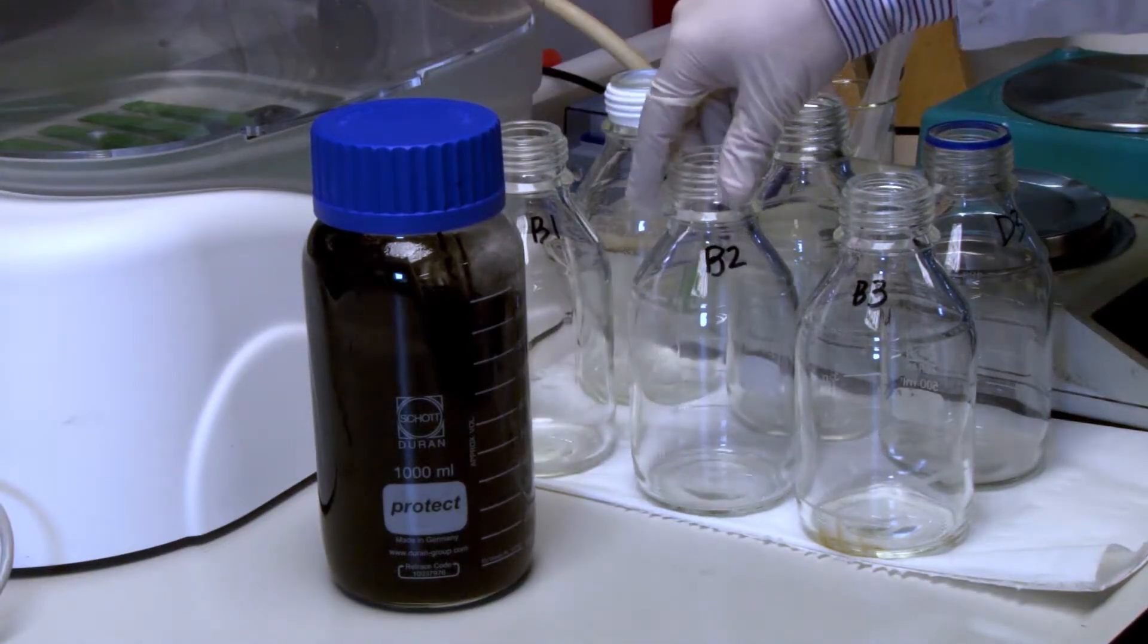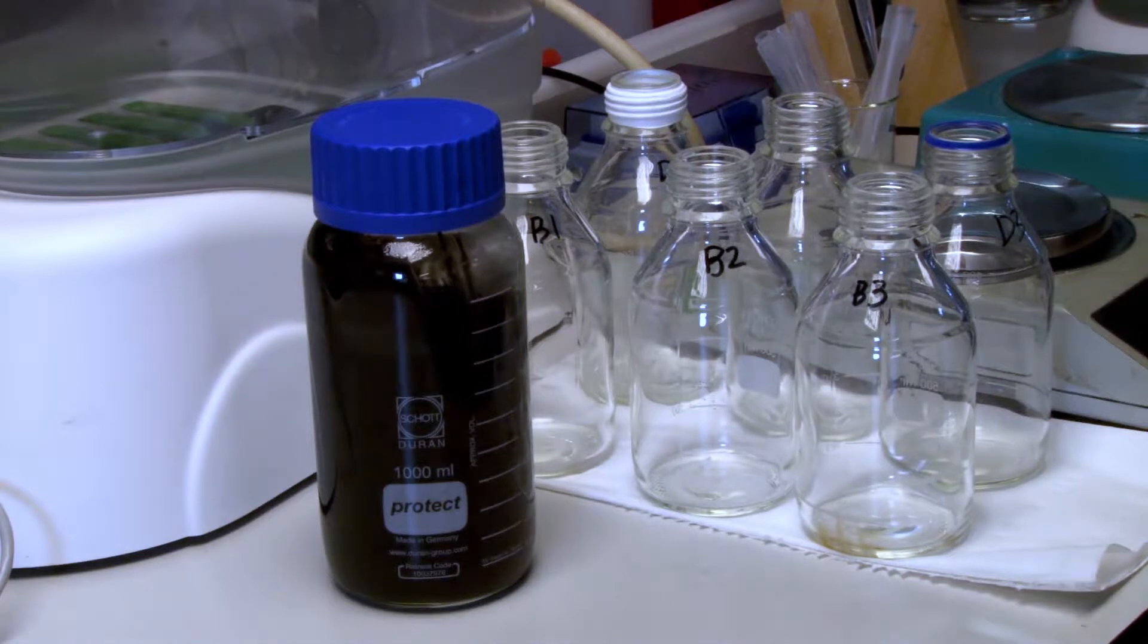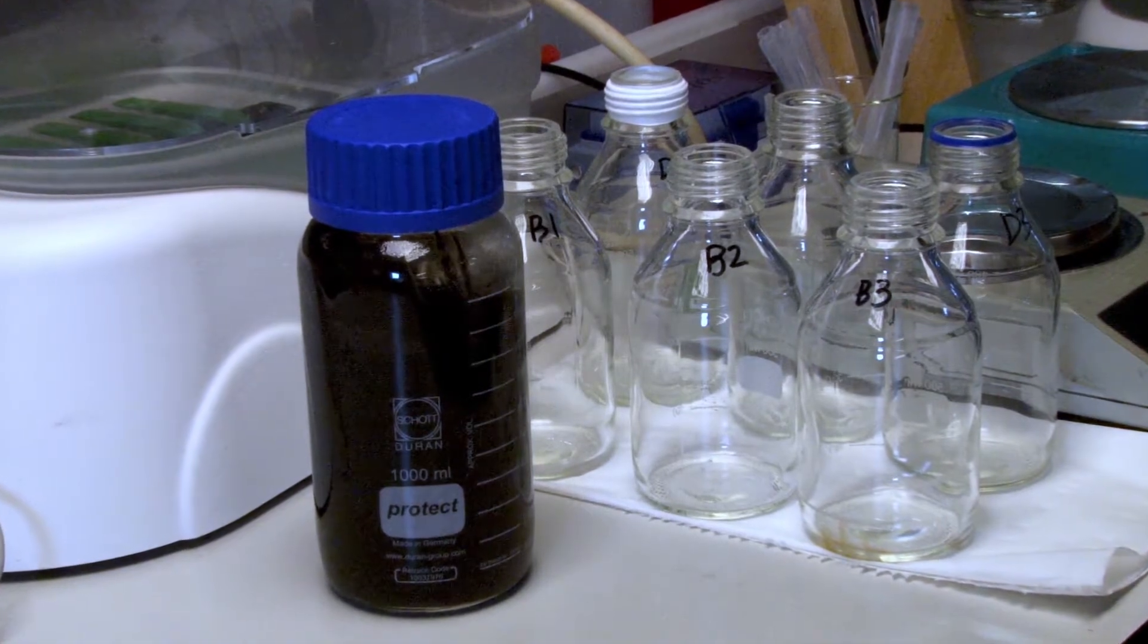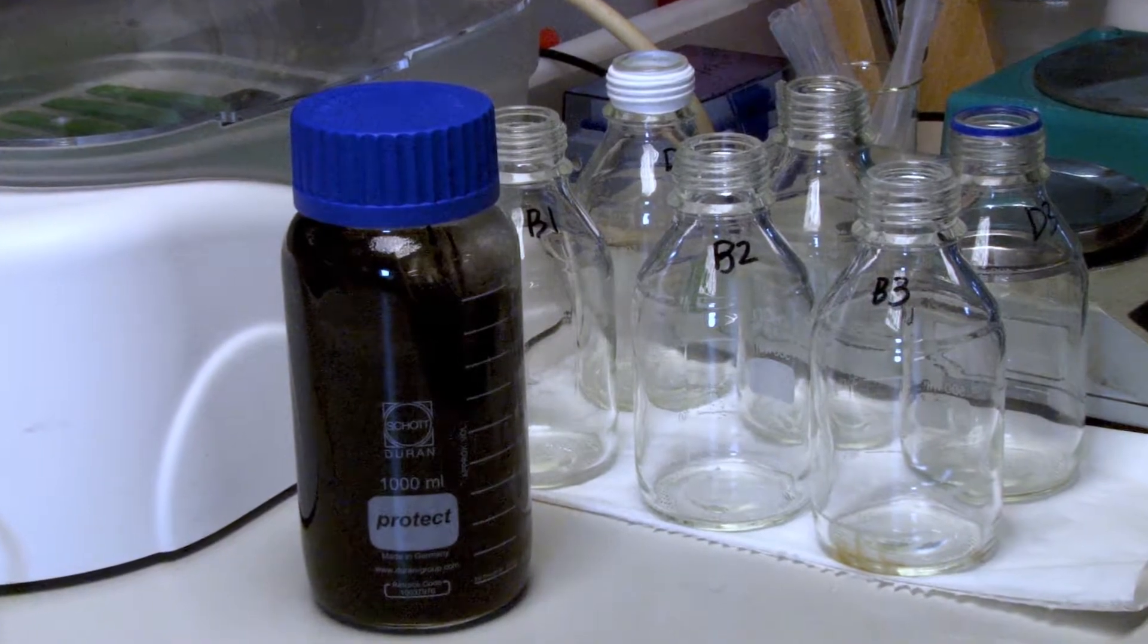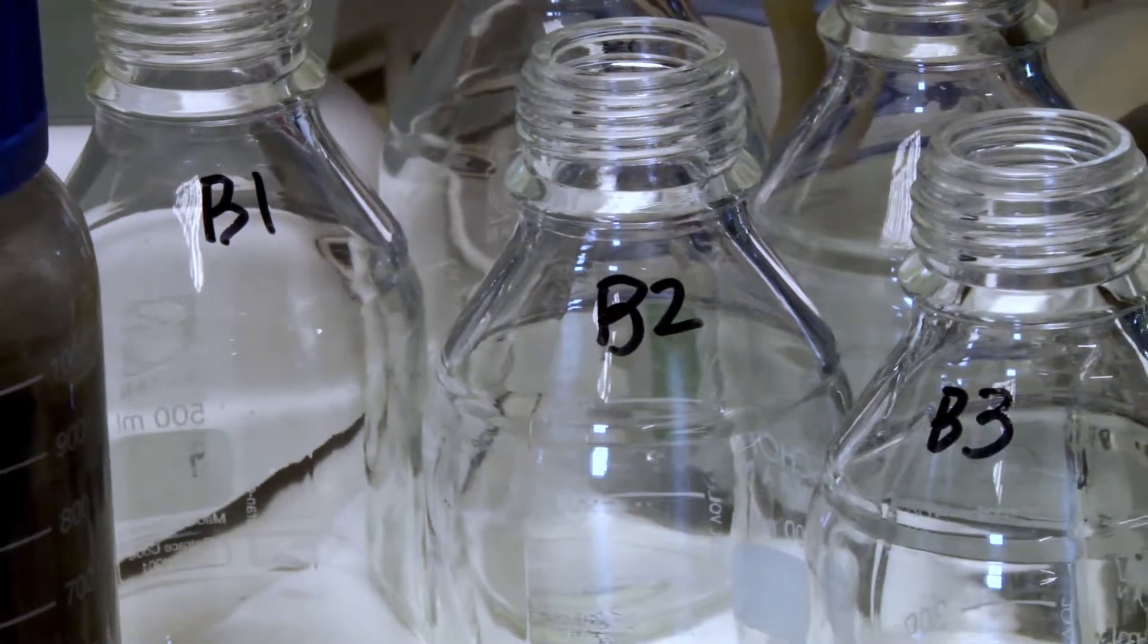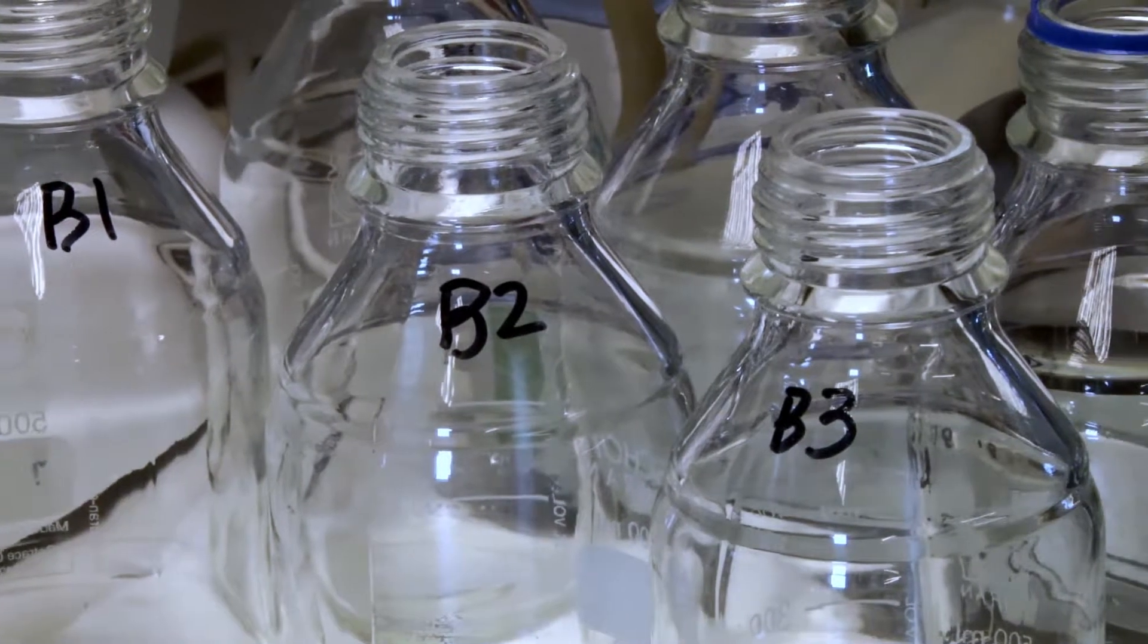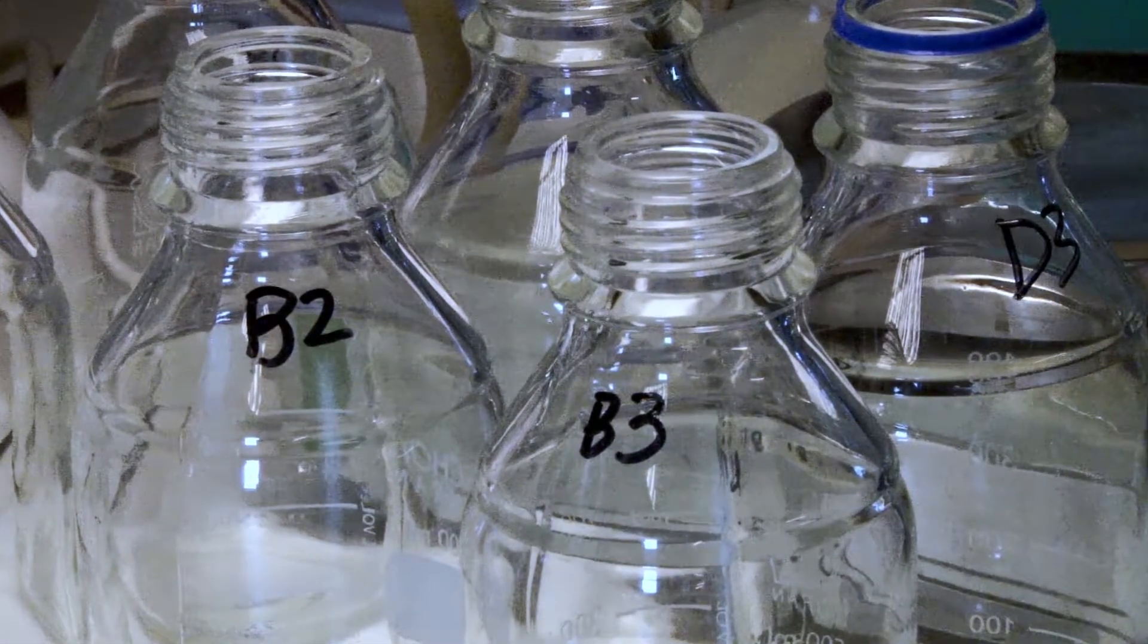The SMA test is usually carried out in triplicate. First, mark all the bottles properly: three blanks and three samples. The blanks contain the inoculum and media without the addition of sodium acetate. The samples contain the sludge and substrate solution.